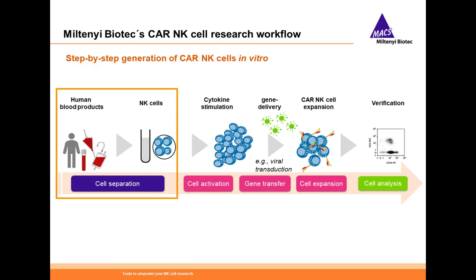But let's now dive into another section of how you're going to study your NK cells. And the first part, of course, will be to isolate your NK cells. This is the first step that you will have to encounter when you're studying your NK cells.